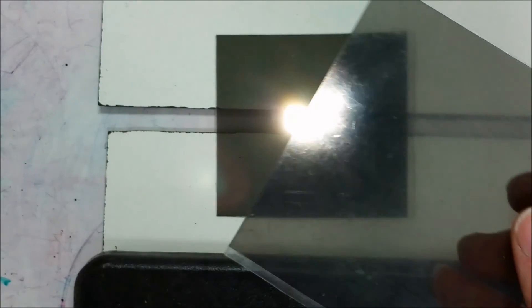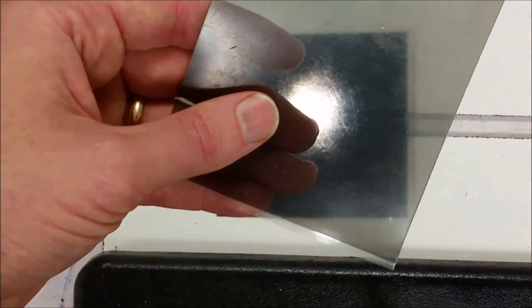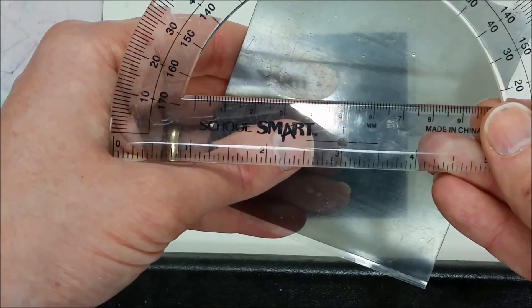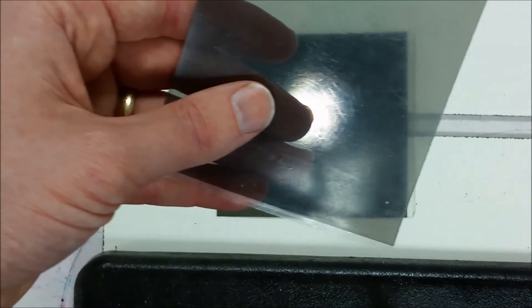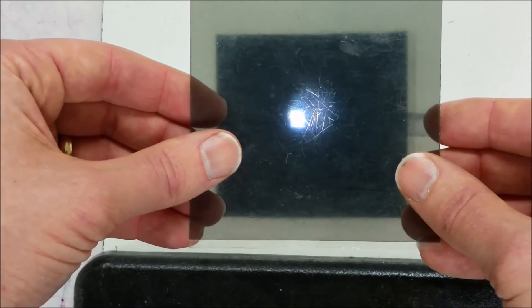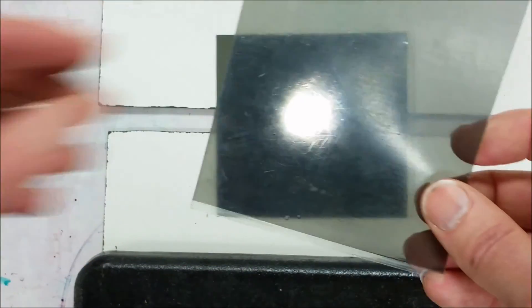Crudely at least, so if we were to hold up a protractor and say, okay, here's the original 90-degree angle, and now we've rotated it this much, we could then figure out how much the plane of polarization has been changed from when there was no sample to when the sample was present.